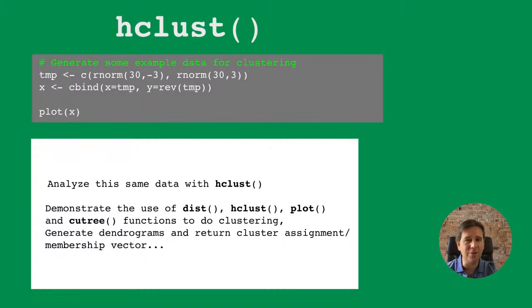It doesn't, underneath the surface, do the distance calculation for you of each point to the cluster center and work it all out. You actually have a lot more flexibility with hierarchical. You can give it different distance metrics or measures of dissimilarity, like sequence identity or structural divergence, RMSD, or whatever kind of measures you're interested in depending on your data, and then pass it to hierarchical clustering.